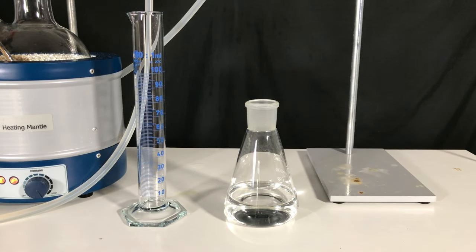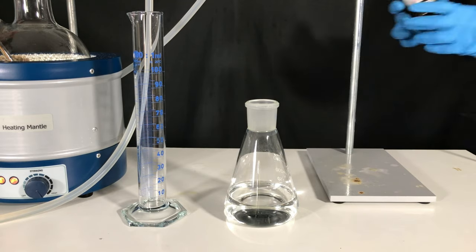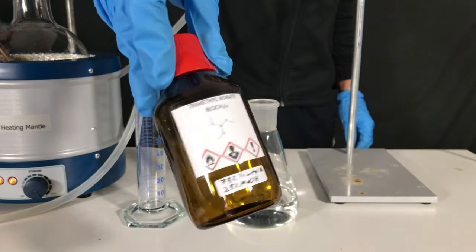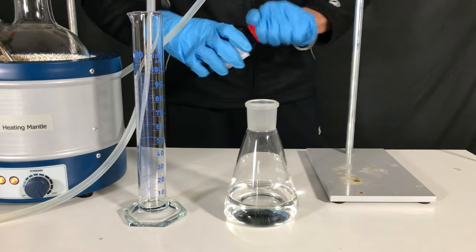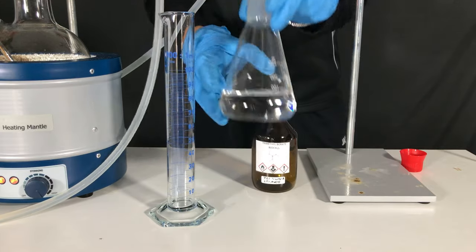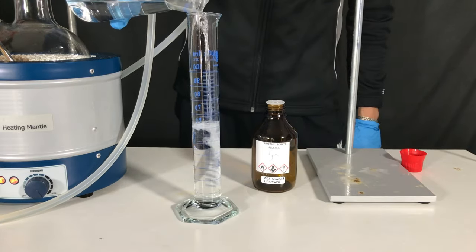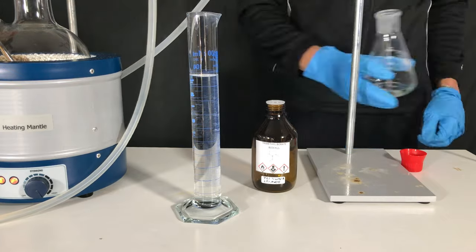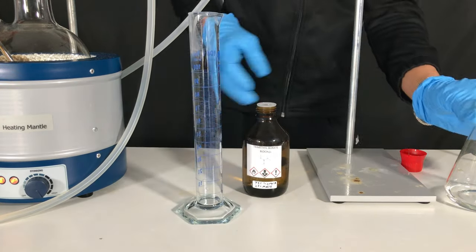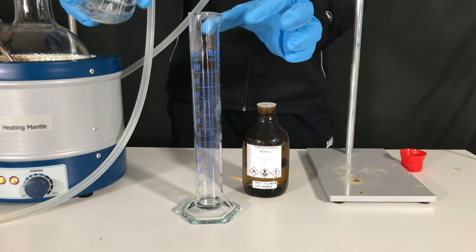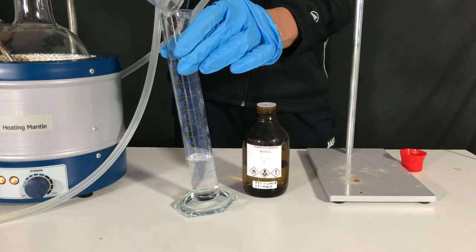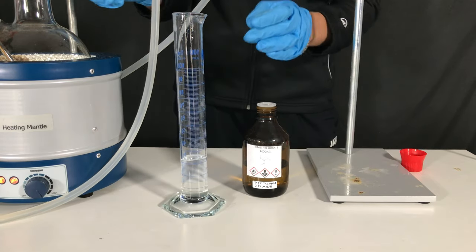While waiting for it to distill over, the methanol tri-methyl borate azeotrope was measured out using a measuring cylinder and was then transferred to a storage bottle. In total, 143 ml were collected. What is interesting is that when you look closely at the measuring cylinder, you can also see some boric acid that formed due to hydrolysis of the trimethyl borate.